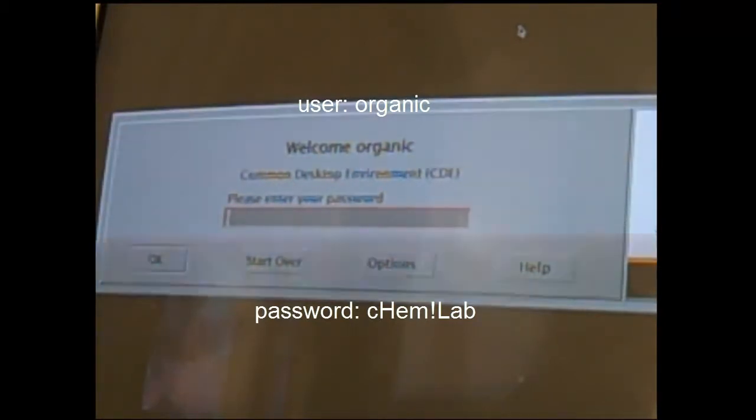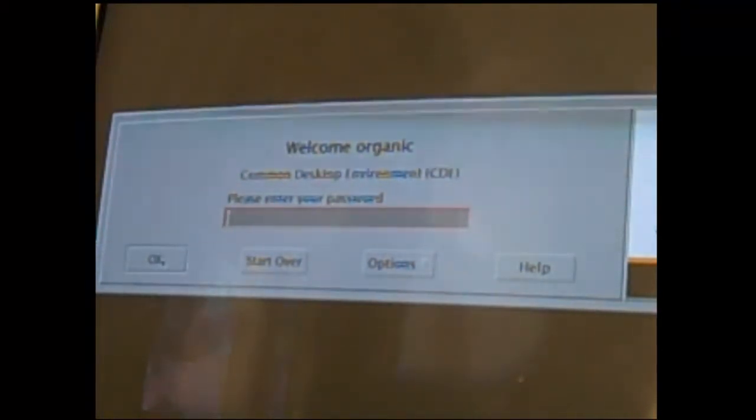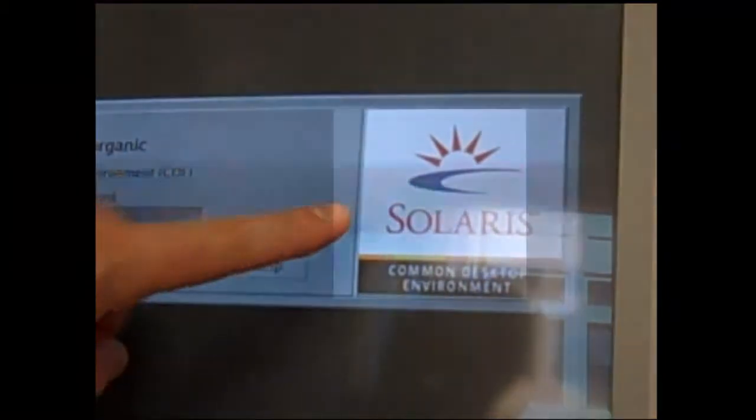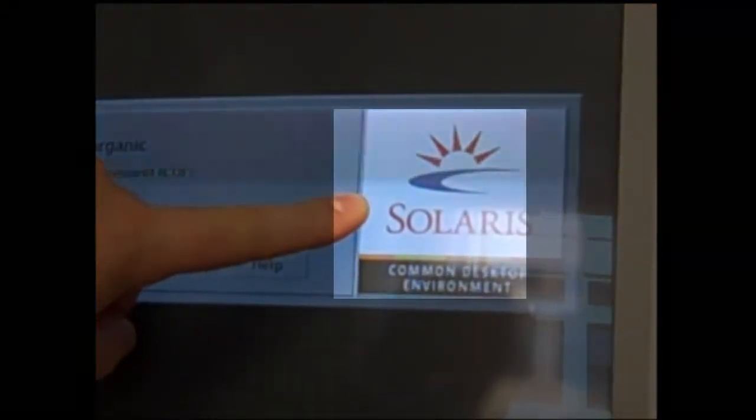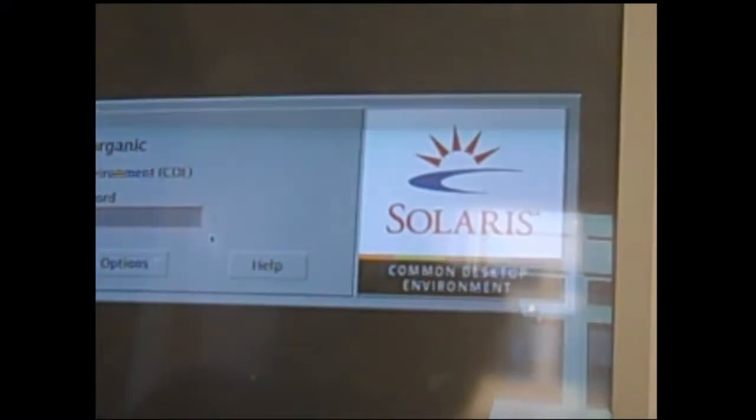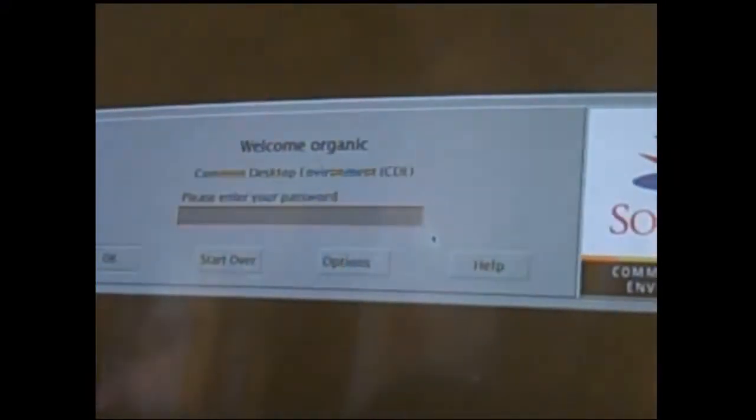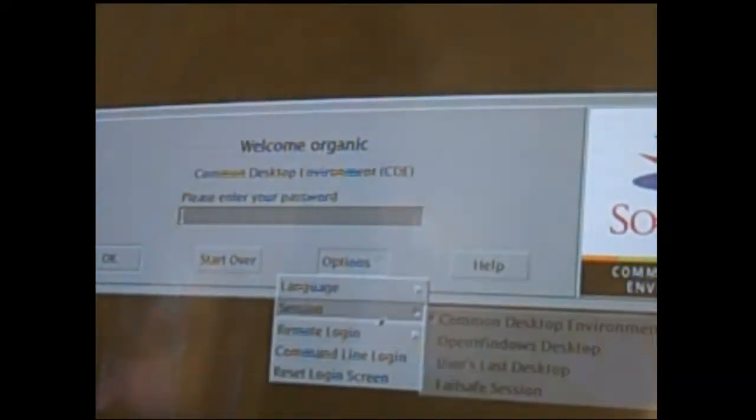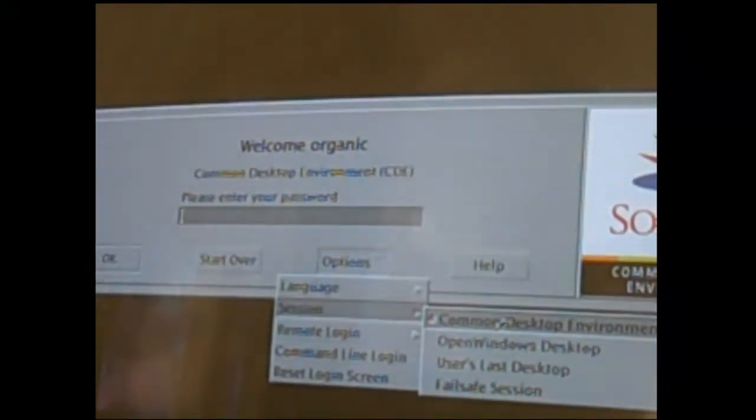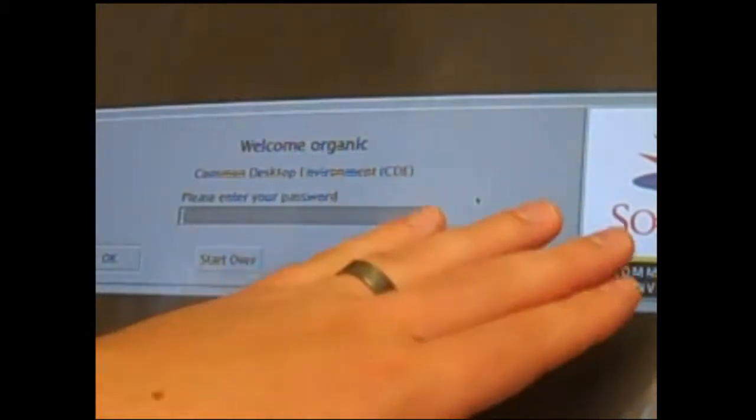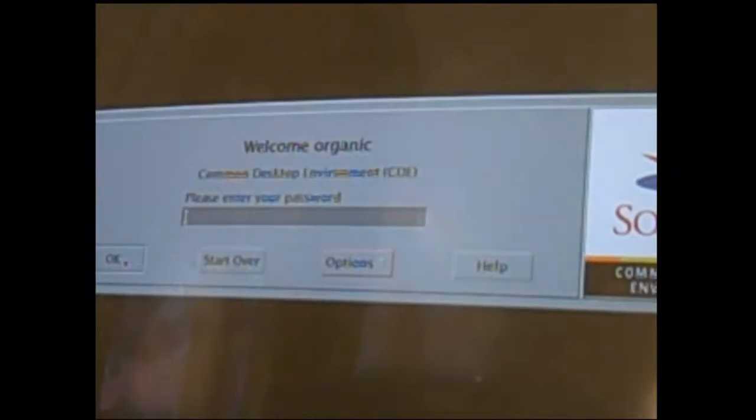As you're typing this you will not see the text appear on the screen, but after you've entered it you can click the OK button. Before moving off the screen, if you do not see the Solaris common desktop environment, make sure you go into the options menu and select session common desktop environment. Once your password is entered correctly, click OK.